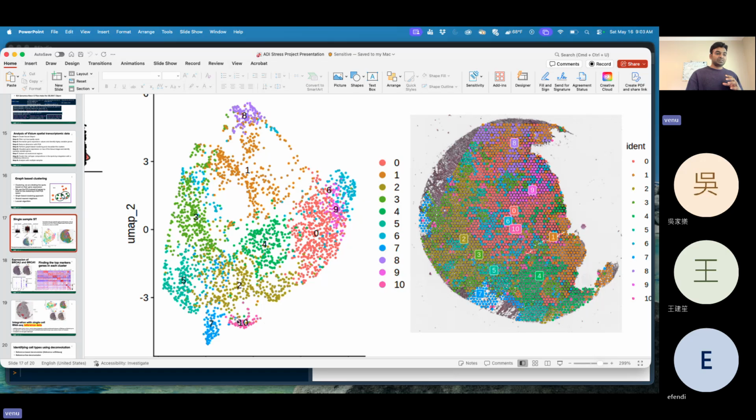So cluster 10, with the spots, makes a group here, but here the majority may be in one place. Sometimes we may see another spot present in another place also. If we look at 8, all the purple color is present here. These spots are similarly expressed spots.